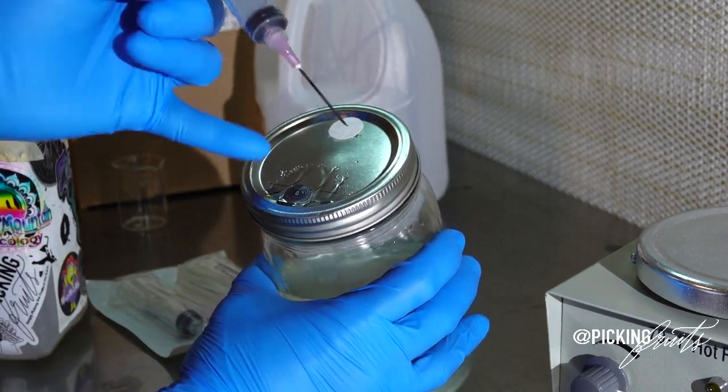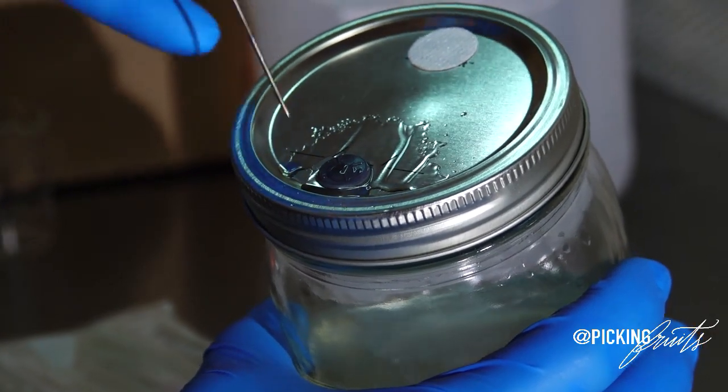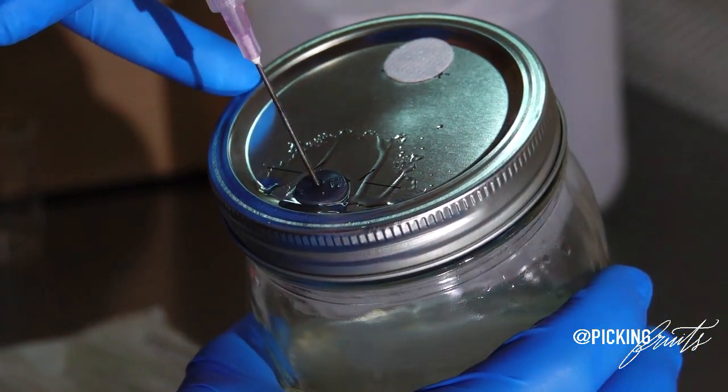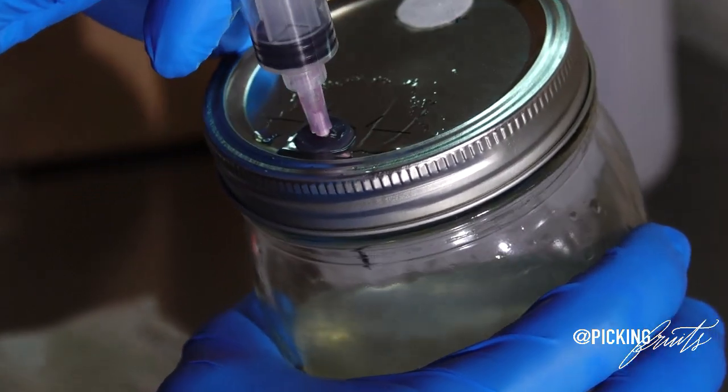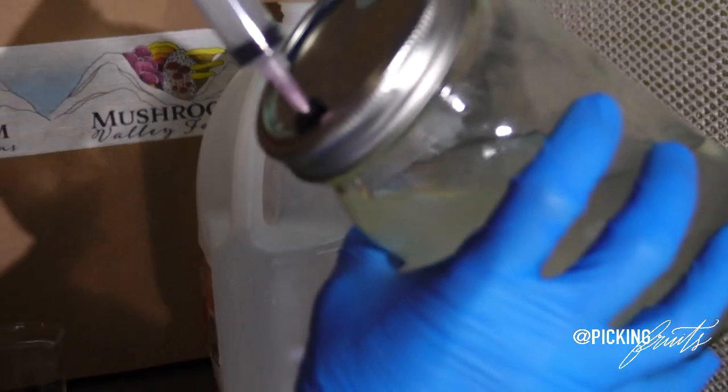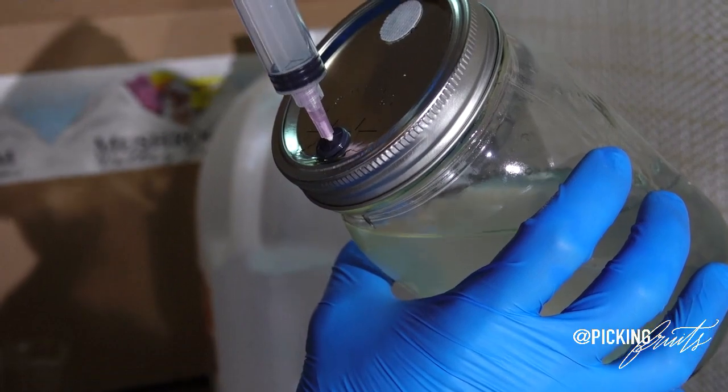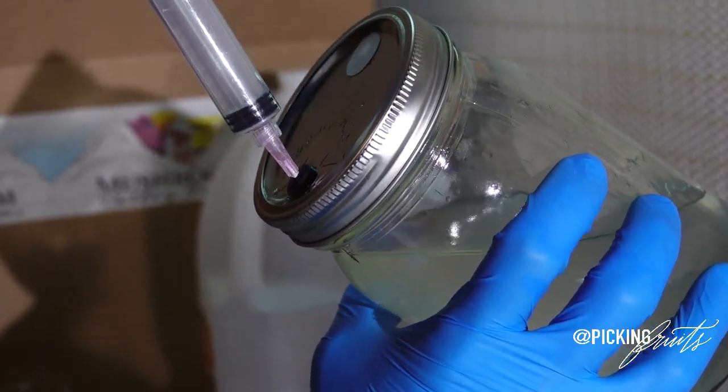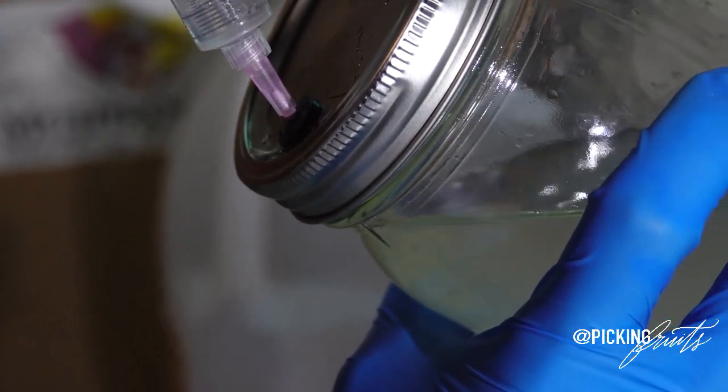Same thing. You are going to take some isopropyl alcohol. You are going to spray your SHIP down. Make sure that your hands don't come into contact with it after it has been sanitized. And then we are going to stick it in the same place. And we are going to tilt our jar back, making sure that we never actually get our filter wet or we never have any liquid coming up to the SHIP. And we are going to draw our liquid and our mycelium into the syringe.